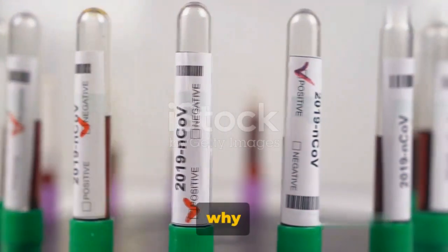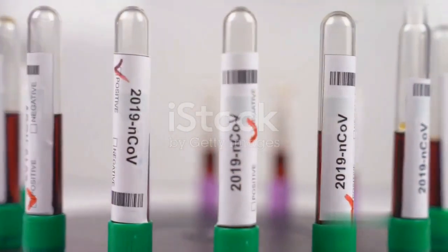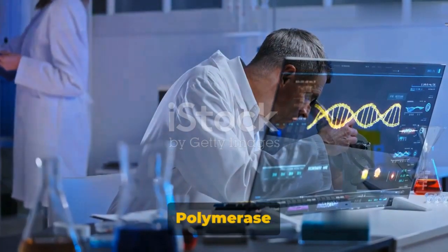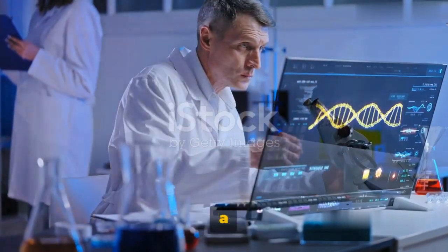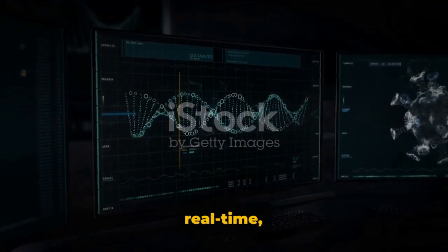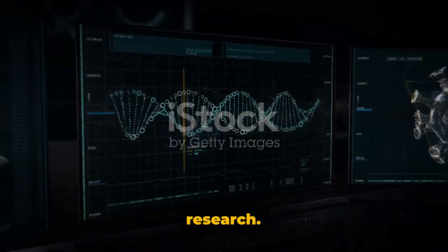Have you ever wondered why fluorescence markers are so crucial in real-time PCR? Well, these markers are like the shining beacons guiding the process of polymerase chain reaction, or PCR, a technique widely used in molecular biology. They play a pivotal role in identifying and quantifying DNA sequences in real time, making them indispensable in both diagnostics and research.